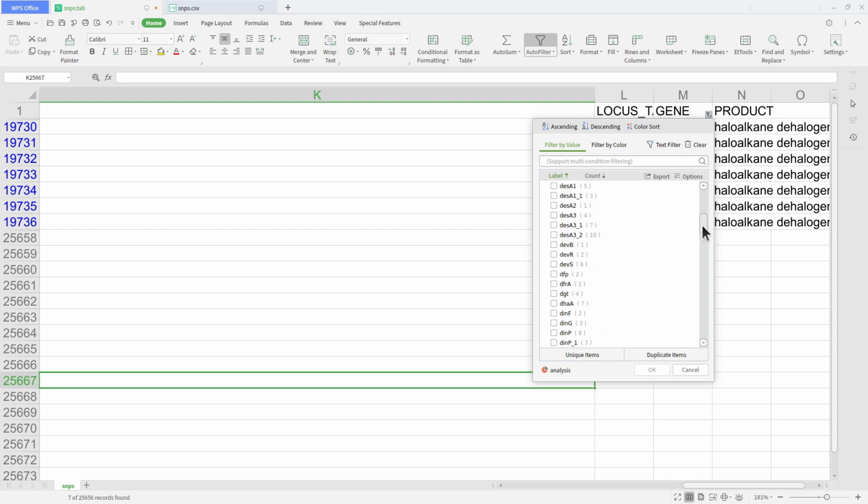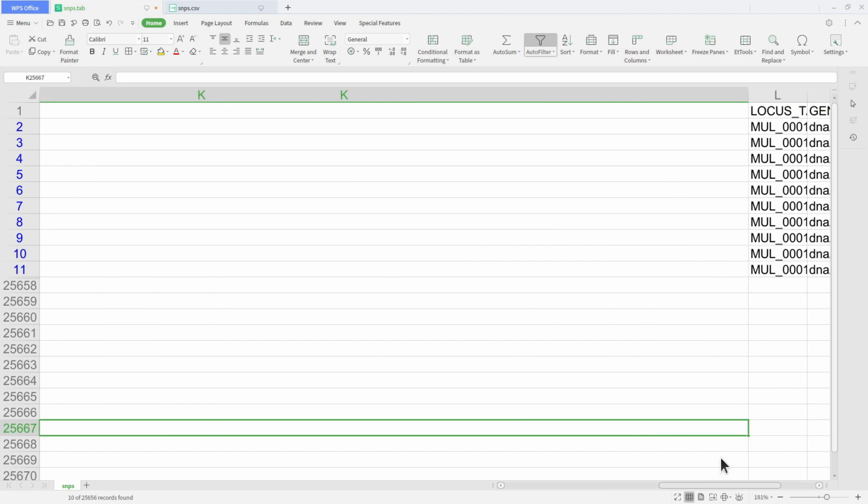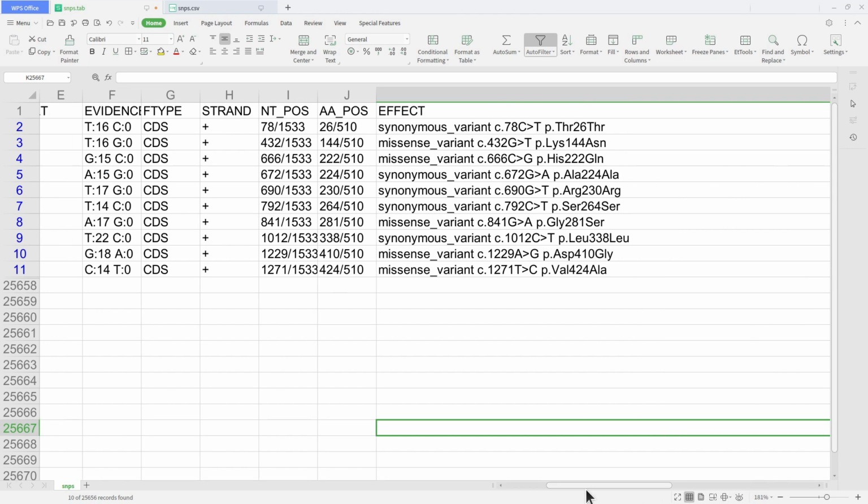Okay, we have a number of them, this one here, DNA. So there we have it, and it's 10. Notice I had to do a little bit of work. So that is what we are going to discuss next.